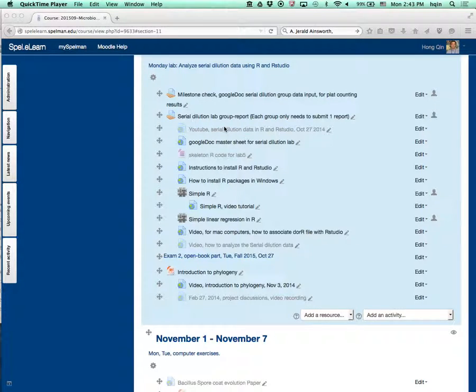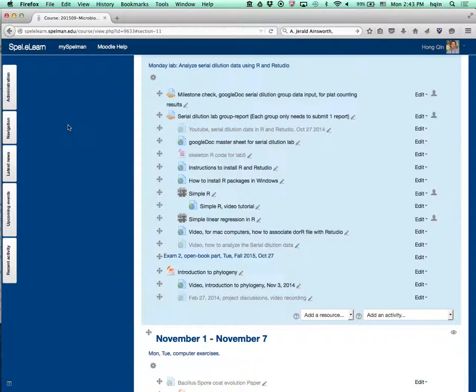This is a demo to show you how to use RStudio to do data analysis for the serial dilution lab. Part of the exercise will also be in the open book exam tomorrow.